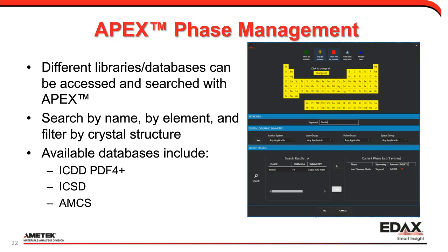Okay, these phases, in addition to being calculated, we have what we call a phase management tool. All the different libraries and databases we have can be accessed and searched through APEX. We can search by name, by element, and we can search and filter by crystal structure.